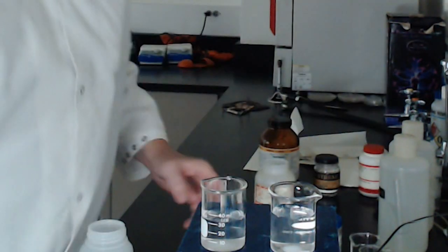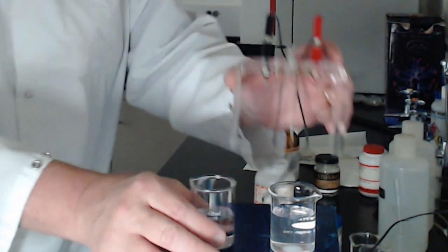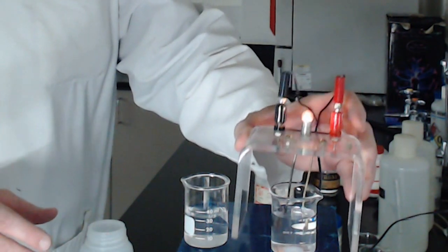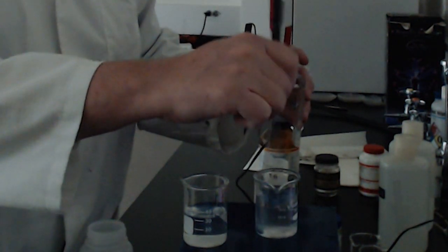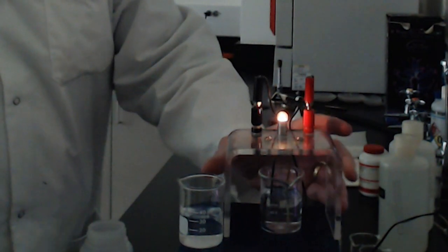And both of these compounds are very good at dissolving in water. So we're now going to test them with our conductor and see which one conducts electricity, or if both of them do. So we're going to take the light bulb away. This is the salt. The salt hasn't finished dissolving, but if we put it on here, ooh, we get a nice light bulb glowing. And for this class, sodium chloride is a strong electrolyte.